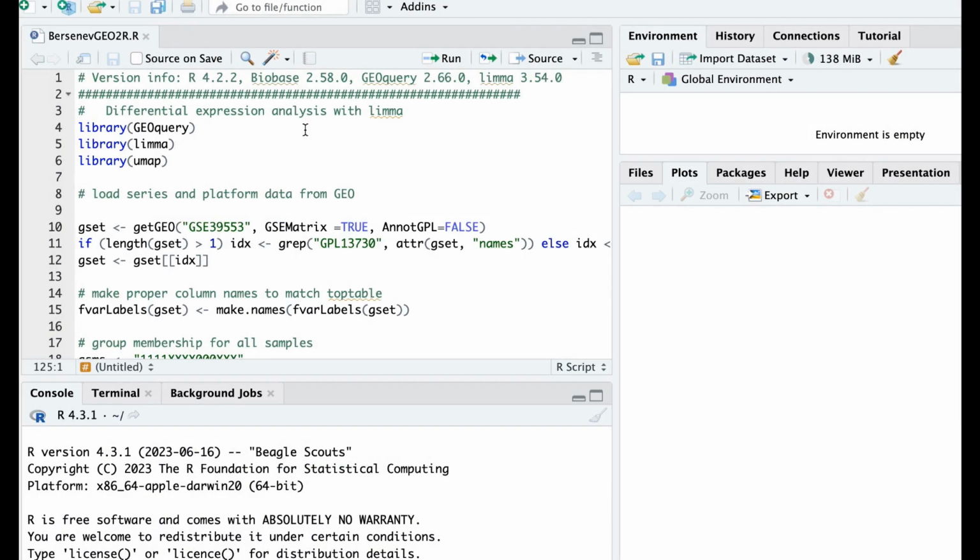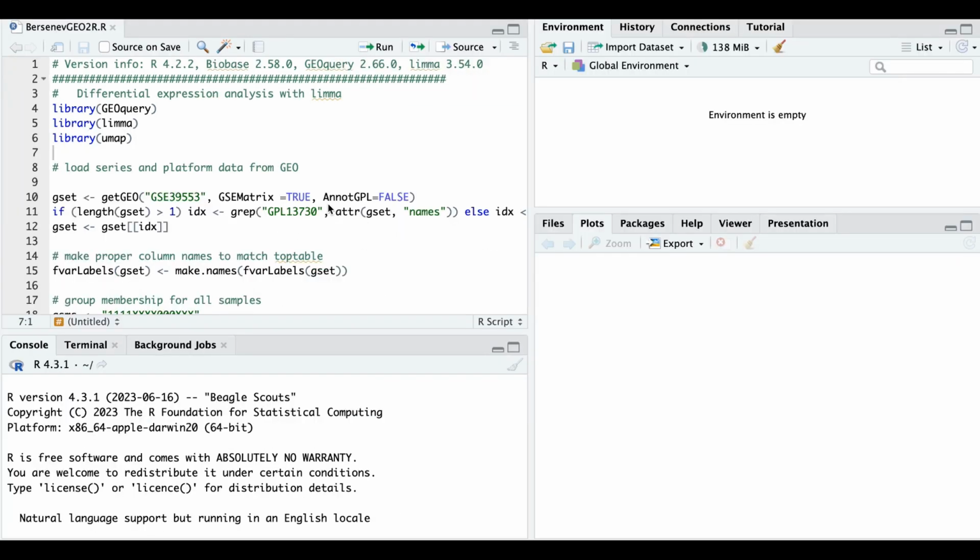And now we can go through this script and check what can stay as it was and what can be changed and simplified. Remember that this is an algorithm generated script. It's written in such a way that it can be used universally for all variety of data sets.